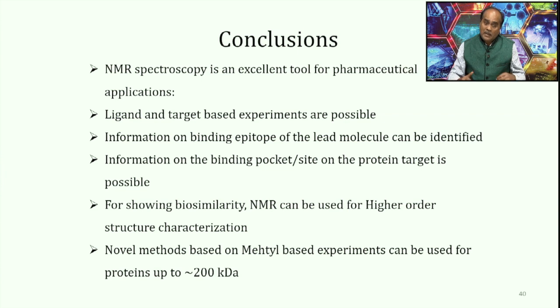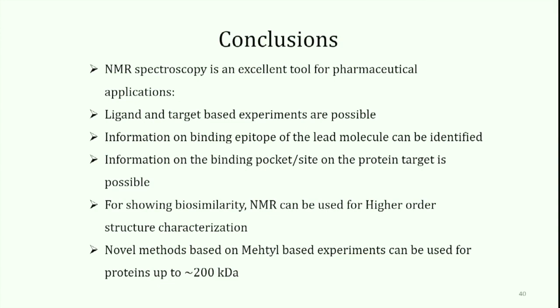So NMR is a tool for the future for biosimilarity assessment. It requires lots of involvement and lots of experiments to be done. A lot more people should be doing this as a preferred technique. So I think some companies should be early adopters of this technique for showing the biosimilarity. That's my hope. And with this, I would like to thank the people who have worked.